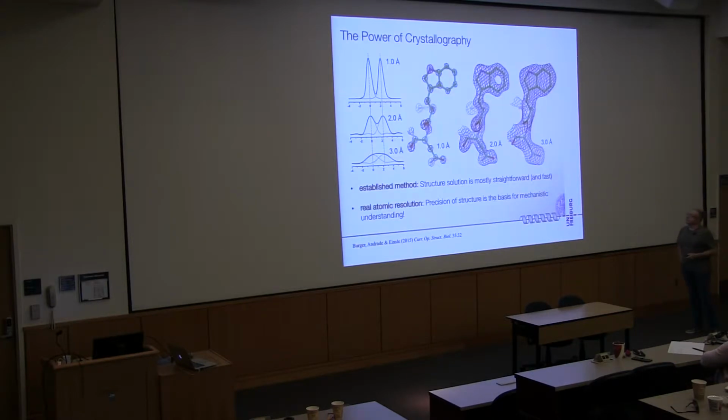However, one of the issues that is not going to be solved so far, and that is a big advantage of protein crystallography, is the aspect of resolution. So in crystallography, we are able to go to resolutions that are still way beyond what you can reach in electron microscopy, and they probably will remain like that for a while. So a 3 angstrom map is a pretty bad map in crystallography.